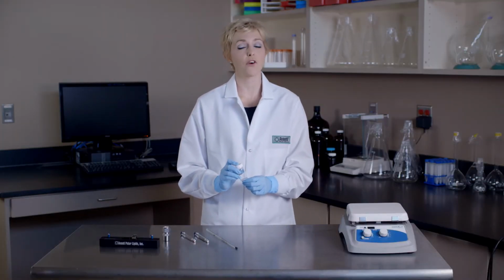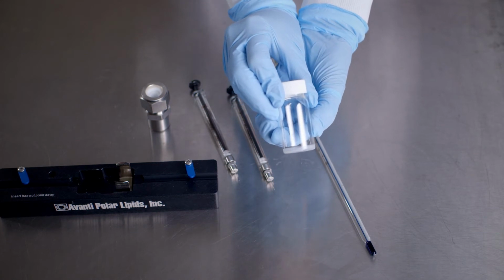Before we begin, here are a couple of important notes. Extrusion of multilamellar liposomal suspensions using polycarbonate membranes with a pore diameter of greater than 0.2 microns will not produce unilamellar liposomes. Liposomes produced from larger pore membranes will yield a polydispersed suspension of multilamellar liposomes. Unilamellar liposomal suspensions with a low polydispersity are only produced using polycarbonate membranes with a pore size less than or equal to 0.2 microns. Second, the polycarbonate membranes and filter supports are intended for a single-use liposome preparation and should not be reused.